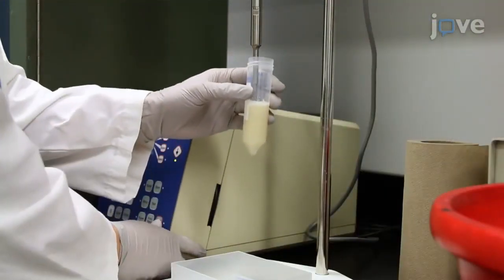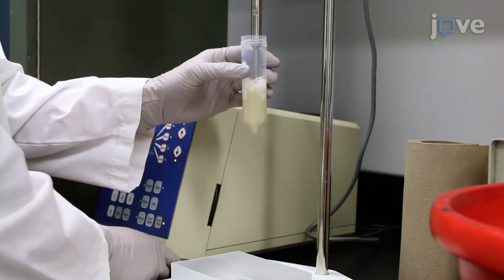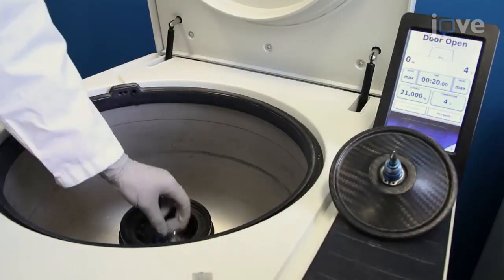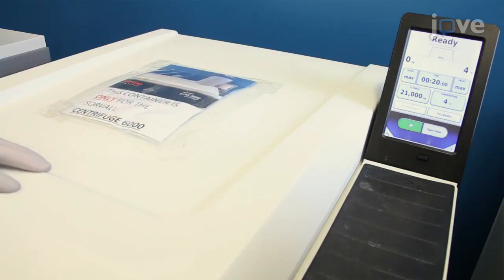Use a probe sonicator to sonicate the lysate at 70% output amplitude for 30 seconds 4 to 5 times. Then, centrifuge at 21,000 times G for 20 minutes at 4 degrees Celsius.